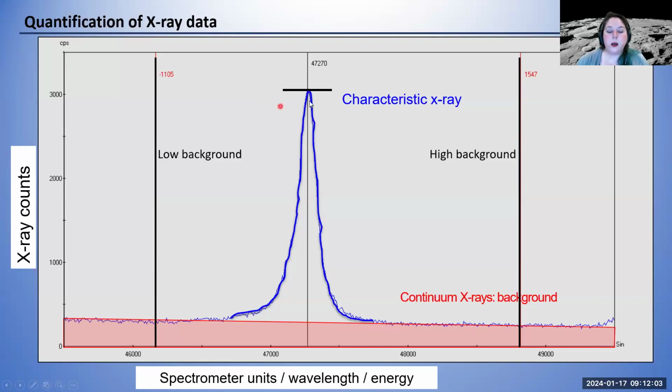Okay, so how do we do that? In EPMA, we analyze, of course, the actual X-ray intensities, but then usually we also have to analyze the backgrounds. We don't want to acquire the entire peak. We instead analyze just two positions, a low background and a high background, and try to fit that as well as possible. The second talk will go into much more detail on all the different ways the software allows you to analyze this background and to process it. I will only show a little bit about that. But that is a very important part if you have complicated samples or you want really high precision, high accuracy data. So Julien Allaz will talk about that.